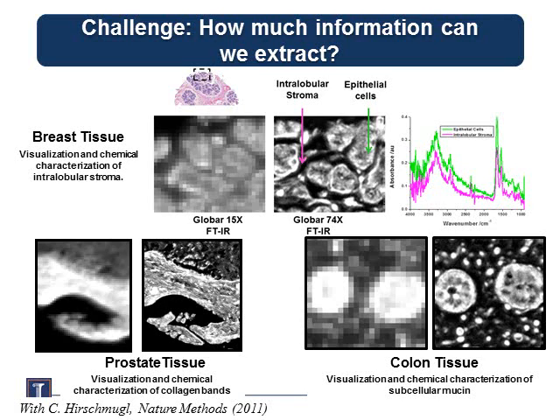With Carol Hirschmugl, a couple of years ago, we published this. What we did here was reduce the pixel size down to a level that was thought unimaginable. This is about 5.5 microns per pixel, and this is half a micron per pixel. You will see right away that this is not a fool's errand. We actually get better quality data from this. And the same thing happens. This was implemented on a synchrotron. This is implemented in our lab, and this is also implemented in our lab.